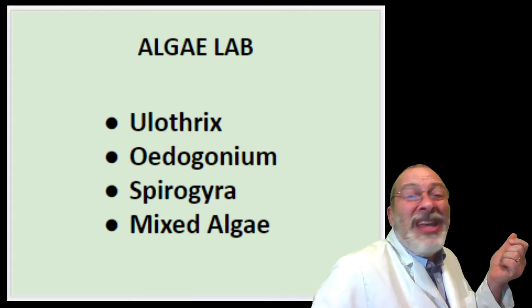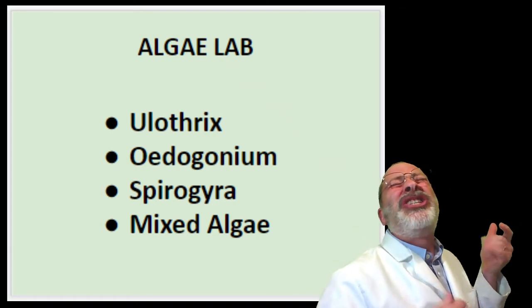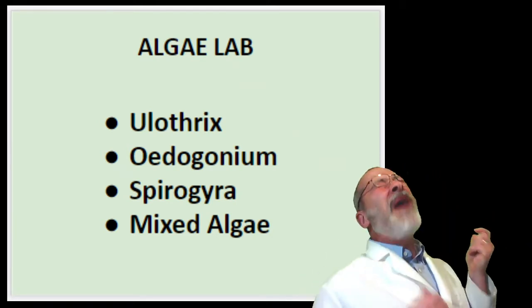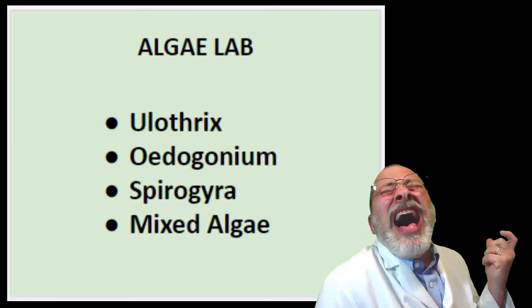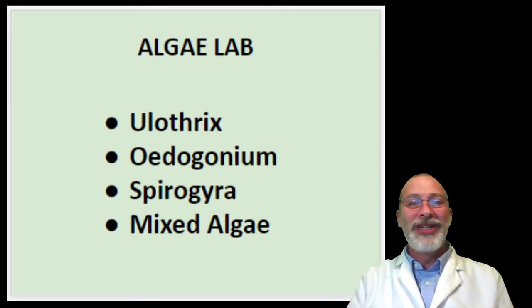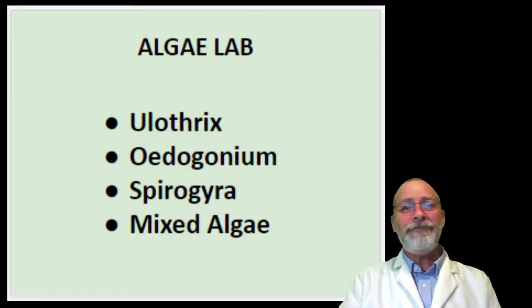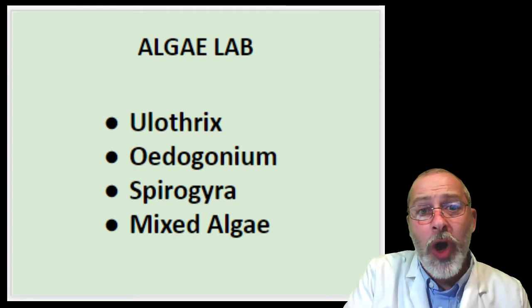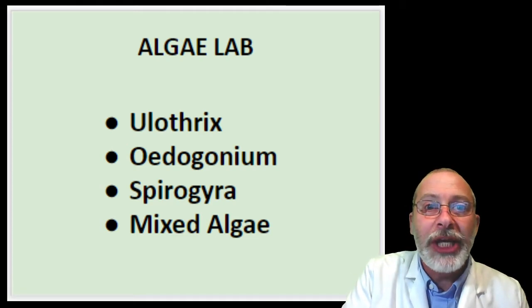Are you ready? Spirogyra. Say it with me. Come on, it's really cool. Spirogyra. And finally, our 4th and final sample for today is called mixed algae.